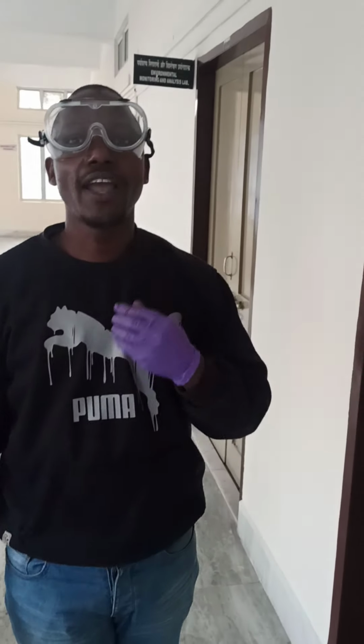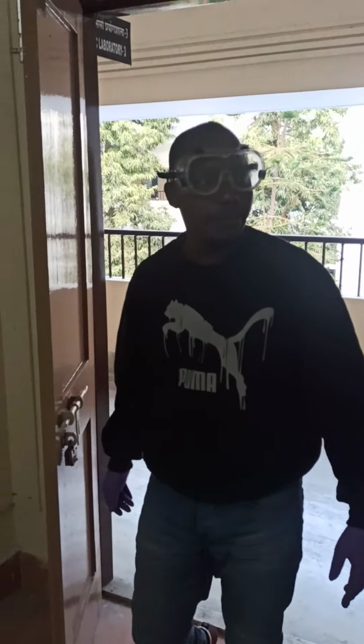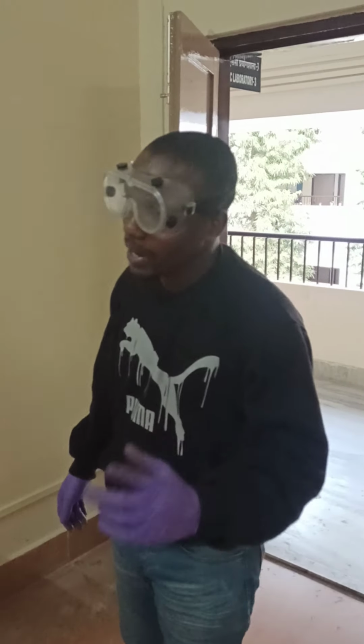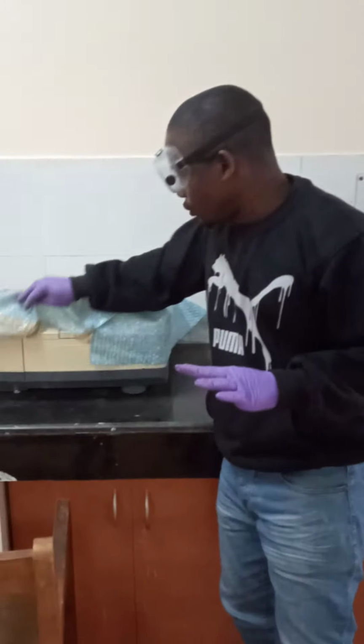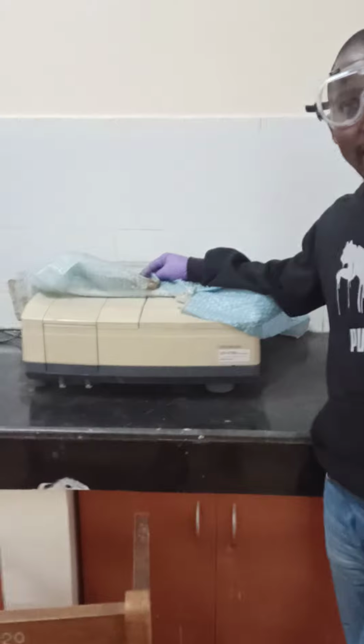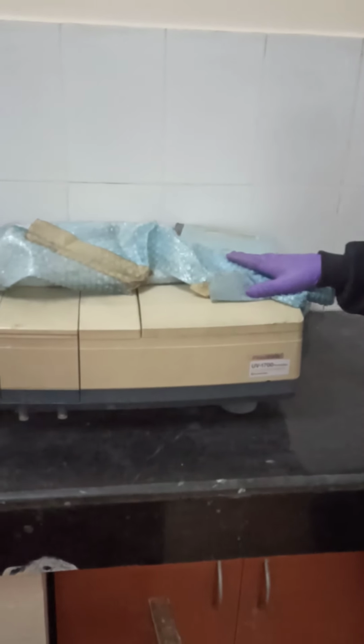How equipped it is and how well the labs is looking for any analytical-related activities. Hope you will enjoy it. This is my lab. It's one of my labs. I'm having 3 labs in this department. Here is one of the instruments that I use to make it analytical. It's called a spectrophotometer.